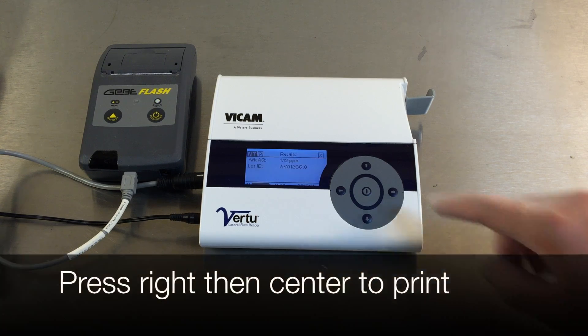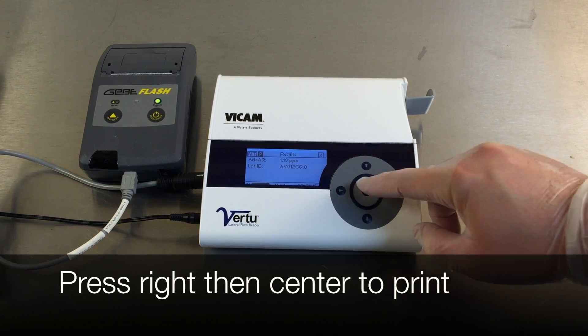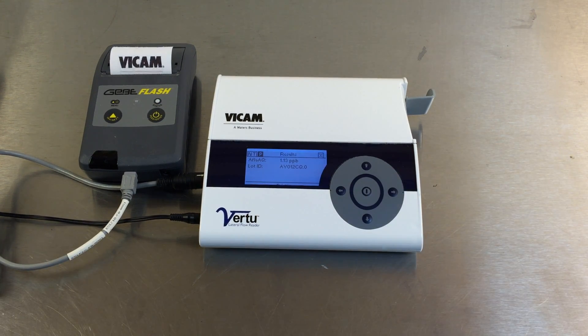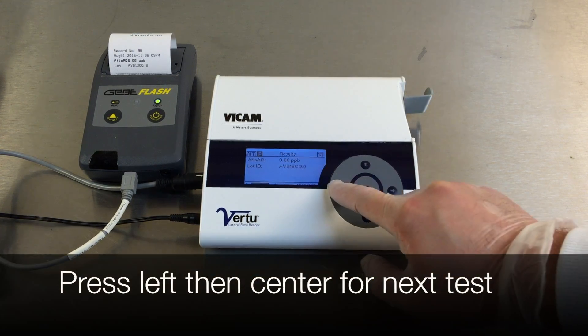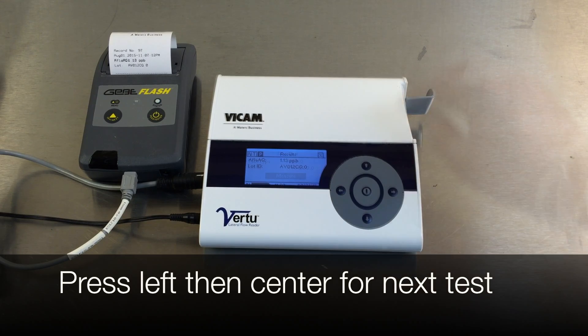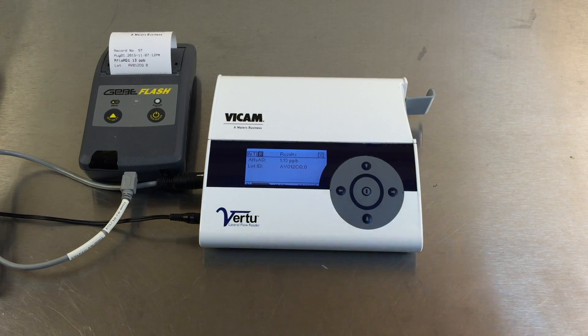Upon test completion, press the right button to select P for print. Quickly press the center button to print. Press the left button to select NT for next test. Quickly press the center button to prepare for the next test.